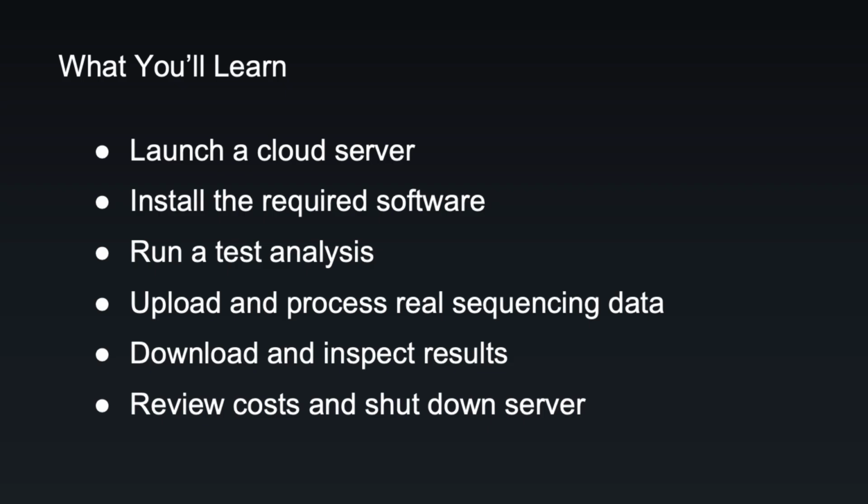So over the course of this video series, we'll learn how to launch a cloud server, install the required software dependencies, run a test analysis, upload and process real sequencing data, download those results back to our computer and inspect the results, and review costs and shut down the server.